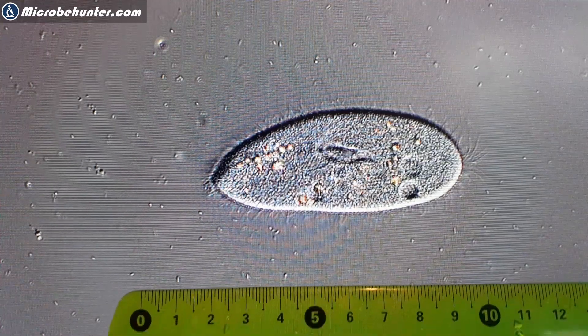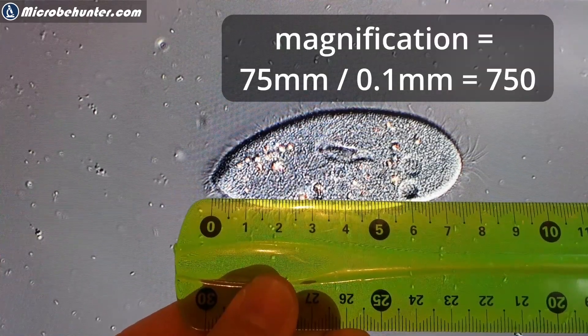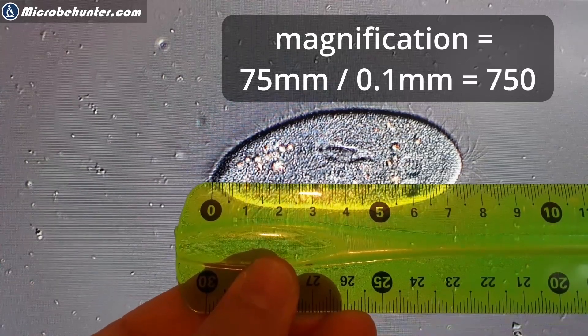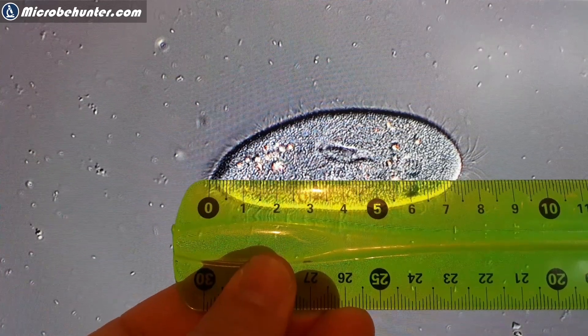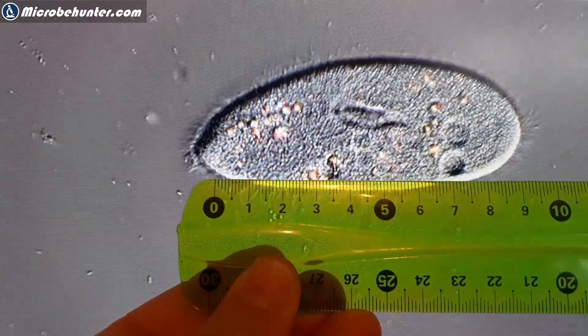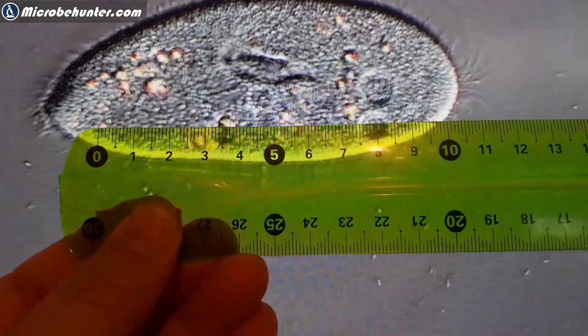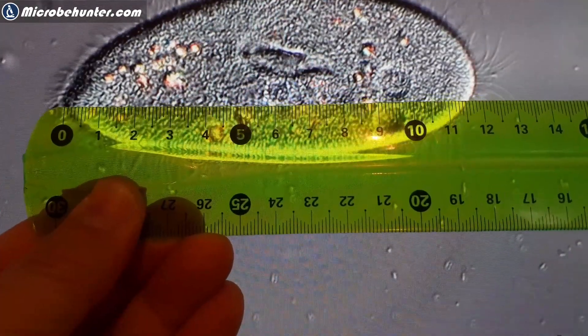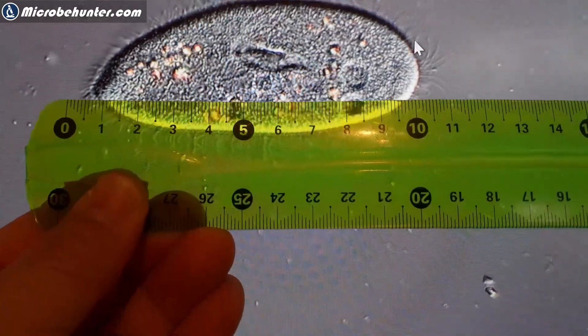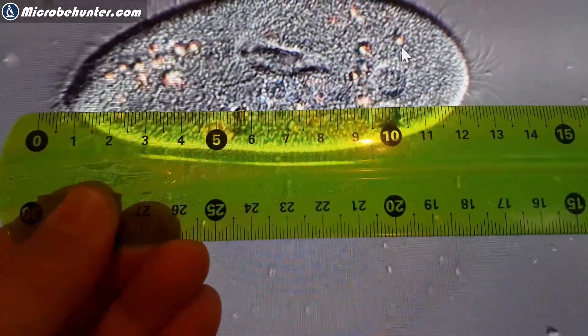I want to show you now that magnification on screen is indeed dependent on the display size. Here the magnification is 750 times because the diameter of the image is 75 millimeters and the original size of the paramecium is 0.1 millimeters. And of course, if you change the size on the screen, this also changes the magnification. This shows that there is no single magnification for images unless they are printed.